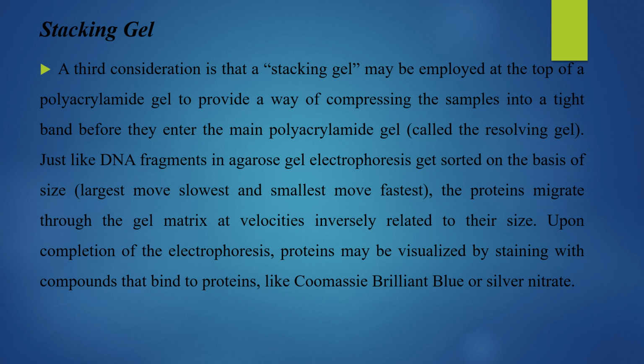Upon completion of the electrophoresis, proteins may be visualized by staining with compounds that bind to proteins like Coomassie brilliant blue or silver nitrate. Now, mind you, the Coomassie is not your Asante Kumasi. It's C-O-O-M-A-S-S-I-E, brilliant blue, or your silver nitrate. So, use of a stacking gel can also help make the use of the gel separation for proteins much better.